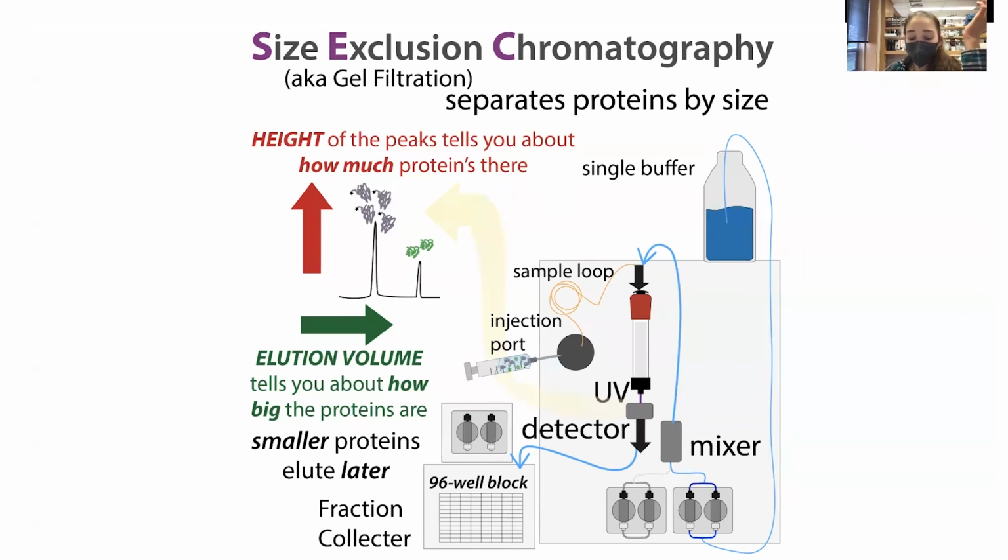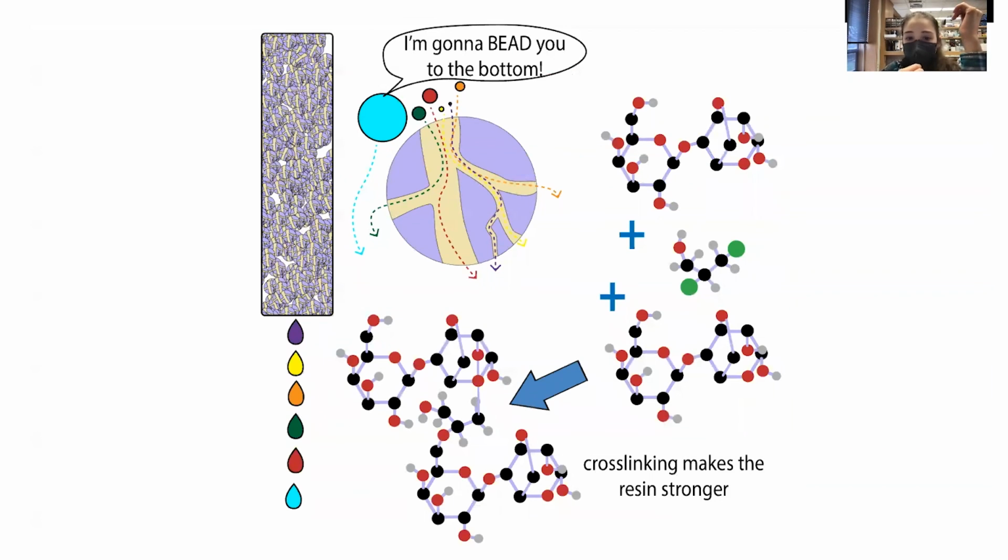We usually talk about using polyacrylamide gels for separating proteins, like in an SDS-PAGE, and agarose gels for separating DNA. But we actually use agarose to separate proteins by size in a technique called size exclusion chromatography, or gel filtration. In this case, it's a form of column chromatography. So we're flowing the protein mixture that contains our protein through this column that's filled with little beads that are going to separate it by size, because these beads have pores that are going to affect their travel.